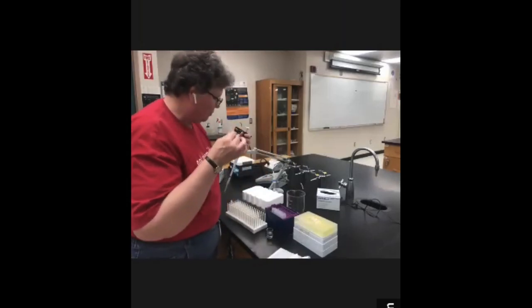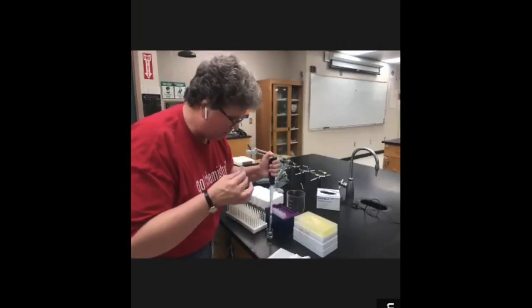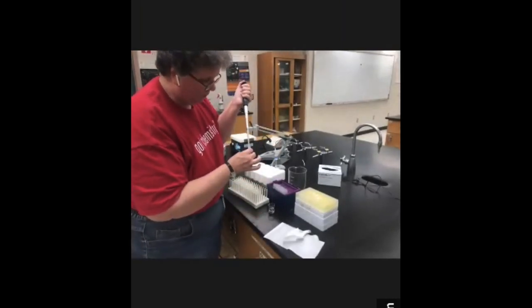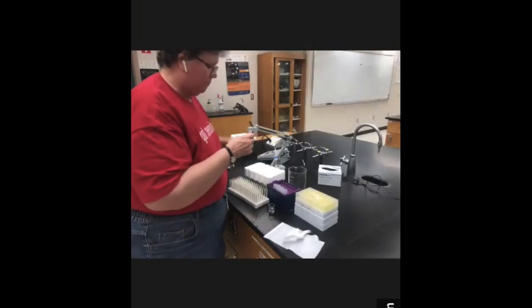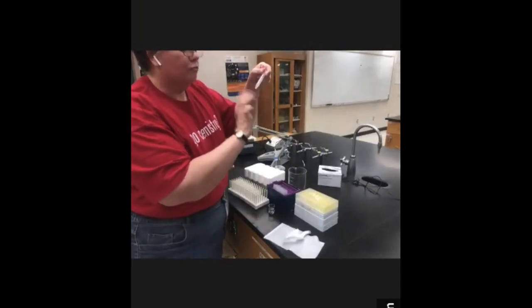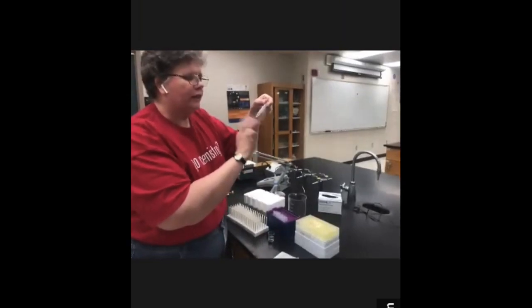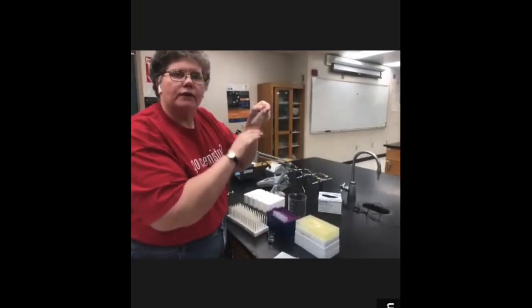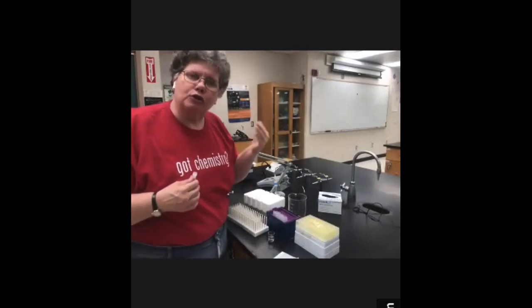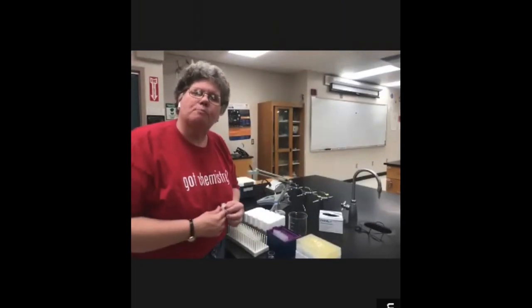So after you've done that, you're going to take a ml of water and you're going to simply add that ml of water and resuspend that pellet by flicking in that ml of water. Once it's resuspended, then you're going to dilute it appropriately and read the concentration on the spectrophotometer.